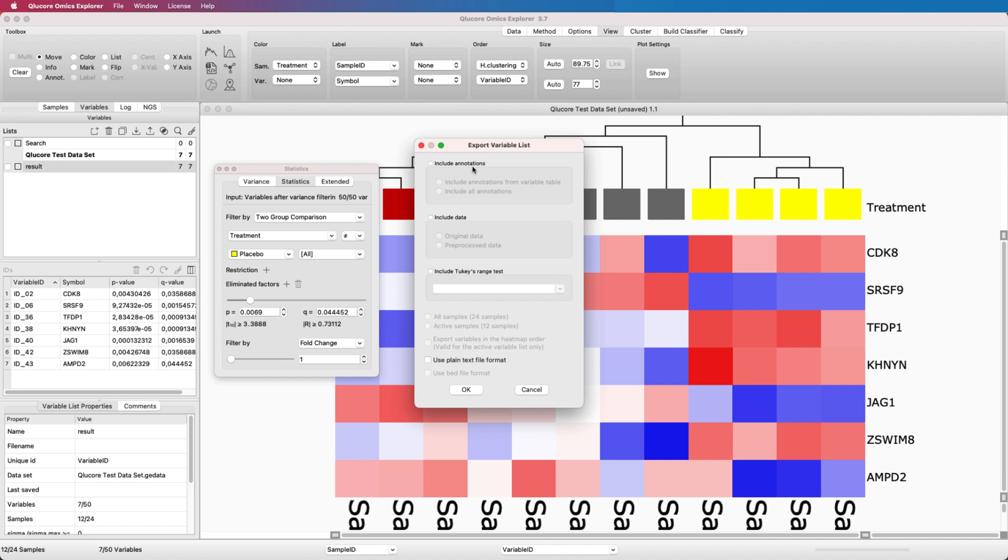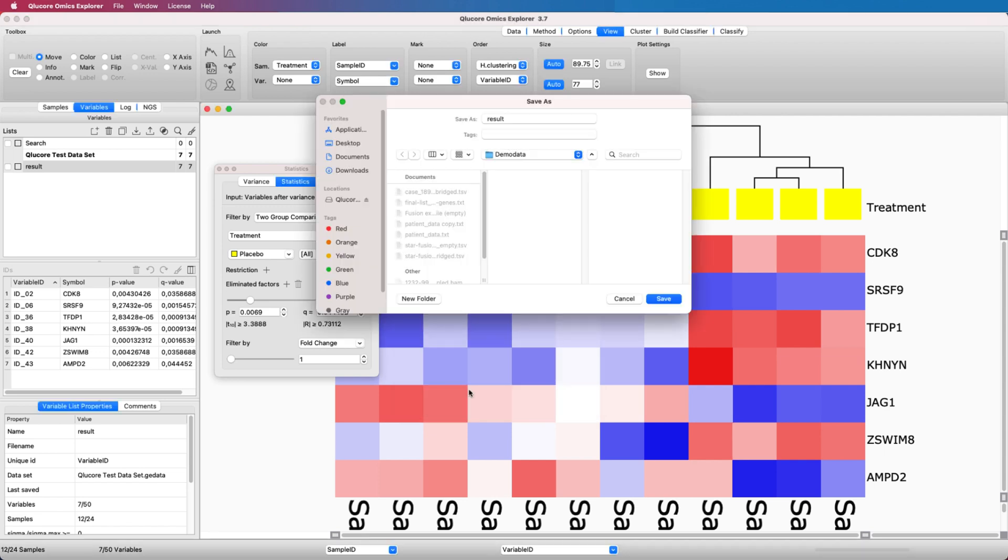When you export the list, you have several options. The default format includes information of when the list was created and also what types of statistical tests were active. If you plan to use the file for downstream analysis, use the plain text setting to get a file that is easier to import.